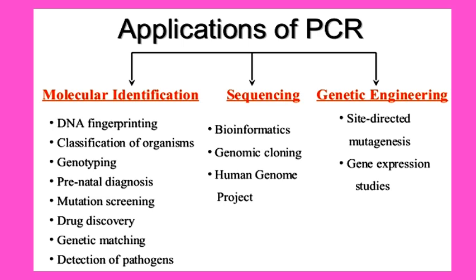Besides human genome projects, which have a lot of useful usage in our lives. And finally, with genetic engineering, such as site-directed mutagenesis and gene expression studies.